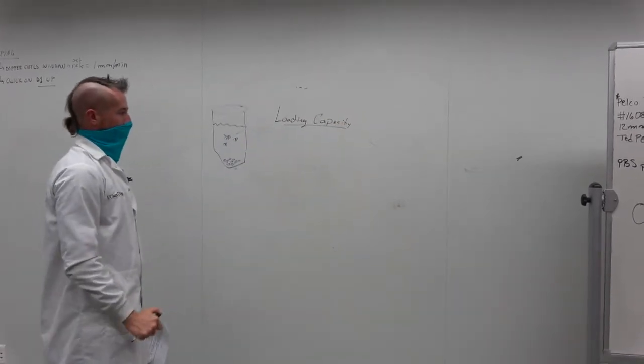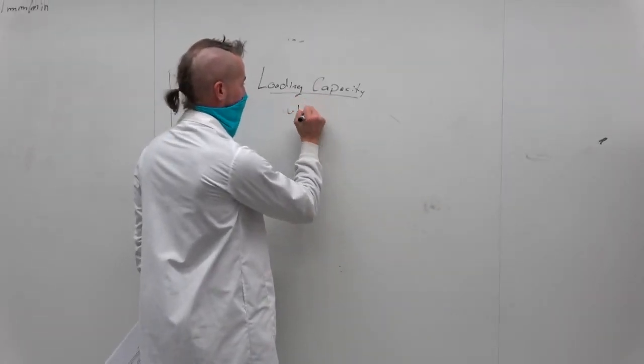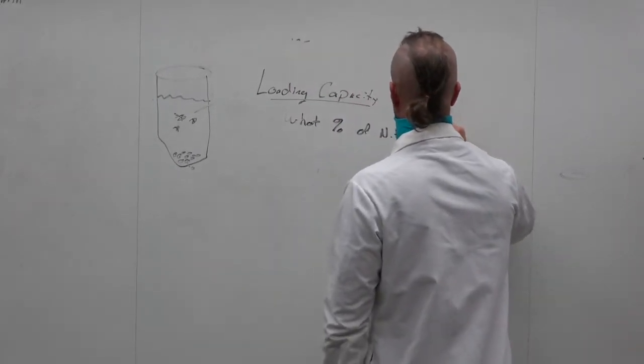And this is basically what percent of the NP is cargo.